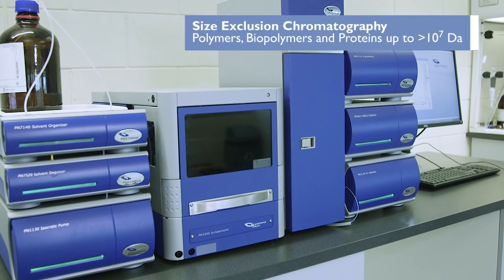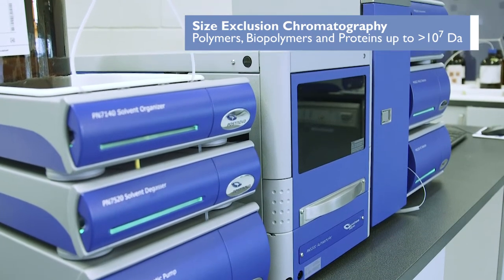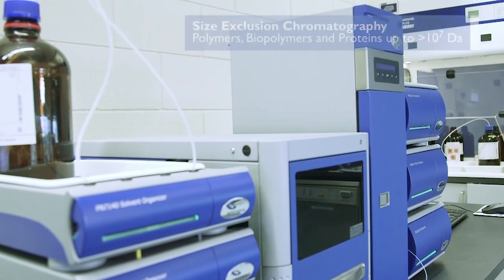The size exclusion chromatography option for the platform is perfect for smaller polymers and proteins. The same sample can be separated sequentially by both techniques, providing valuable orthogonal data, particularly when analyzing protein aggregates.